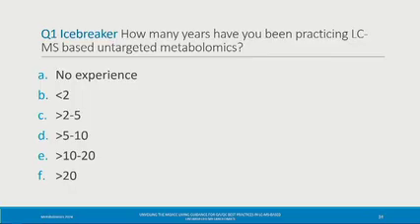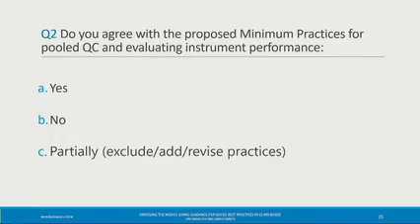Okay, we move to question number 2. Do you agree with the proposed minimum practices for pool QC and evaluating the instrument performance? A, yes. B, no. C, partially. You might want to exclude, add, or revise the practices.